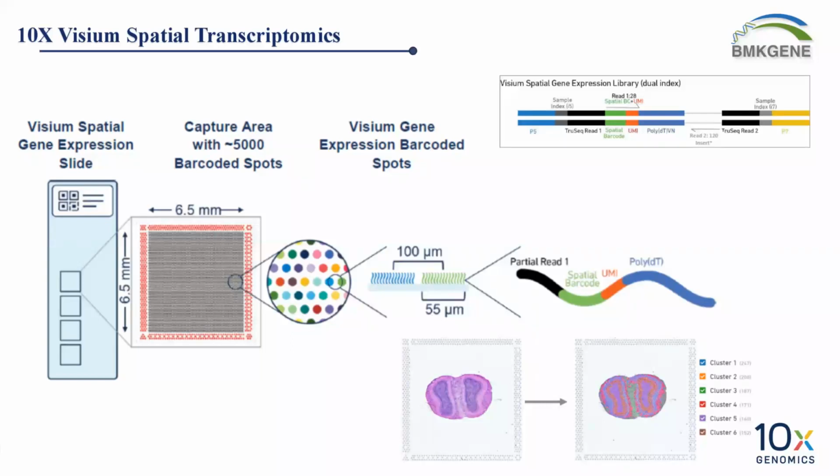And the reason that we need to introduce UMI here is that if you imagine the size of this spot, there will be only a very limited amount of mRNA released onto each single spot. So there will be many, many rounds of PCR reactions. And this UMI just helps us to have a much, much more accurate quantification of this mRNA expression data.